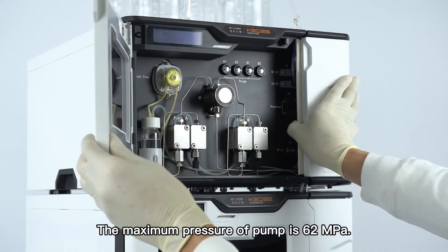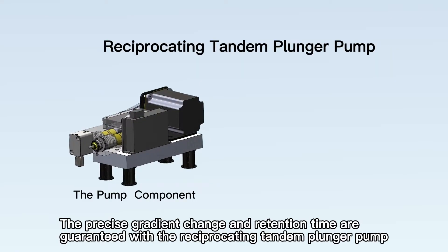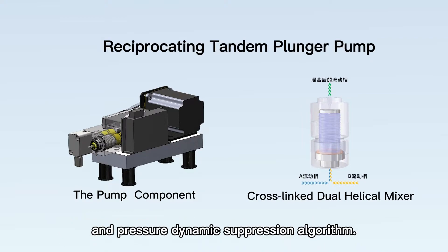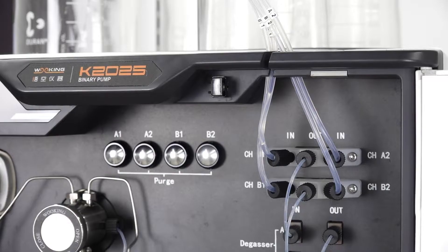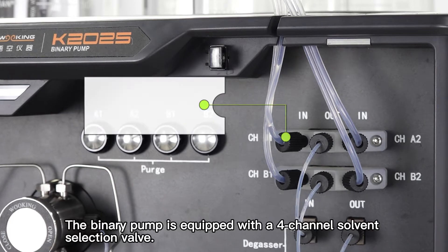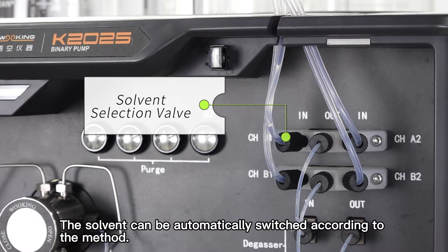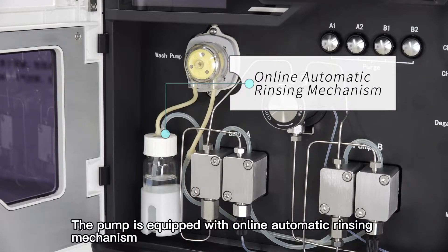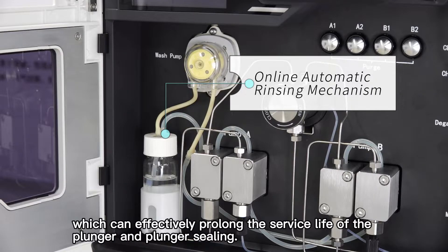The maximum pressure of the pump is 62 megapascals. The precise gradient change and retention time are guaranteed with the reciprocating tandem plunger pump and pressure dynamic suppression algorithm. The binary pump is equipped with a 4-channel solvent selection valve. The solvent can be automatically switched according to the method. The pump is equipped with an online automatic rinsing mechanism, which can effectively prolong the service life of the plunger and plunger sealing.